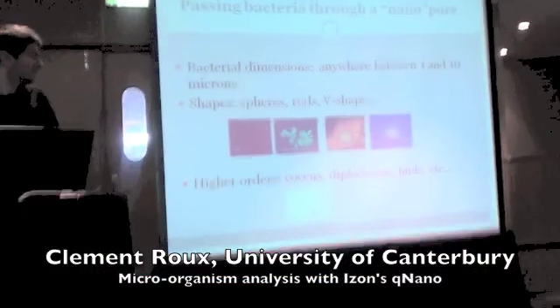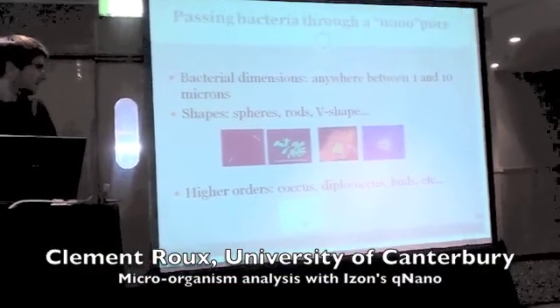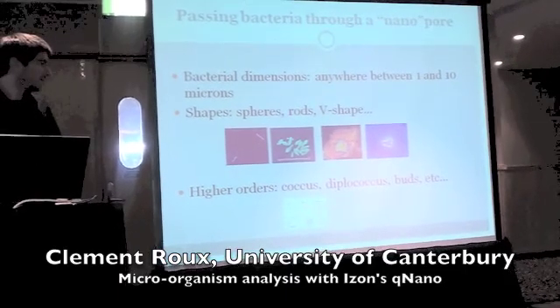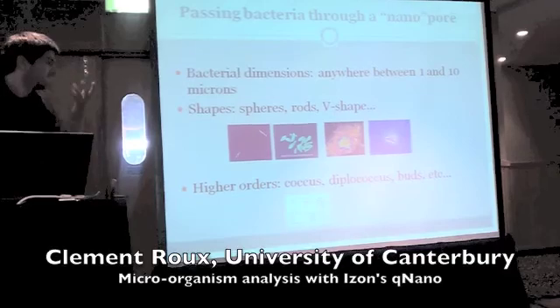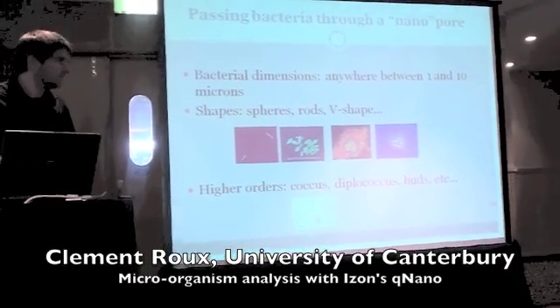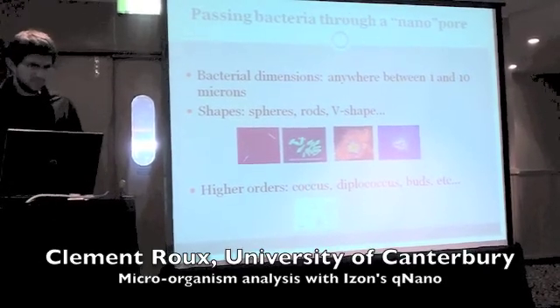In the higher orders, you encounter coccus, diplococcus, and so on. So essentially cocci, such as Staphylococcus aureus, tend to arrange in higher order arrangements. So you get these sort of grape shapes, you get strings of beads, all sorts. It's not always easy.